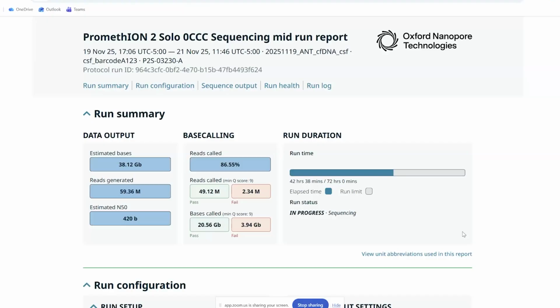And that's the same with Dorado? I can just feed it the folder of POD5 files? Yeah, exactly. You don't have to list each one, you can just pass it the folder. Yeah, and it'll look inside that. I think most of them can do recursive searches, which you may or may not want. So just be aware.